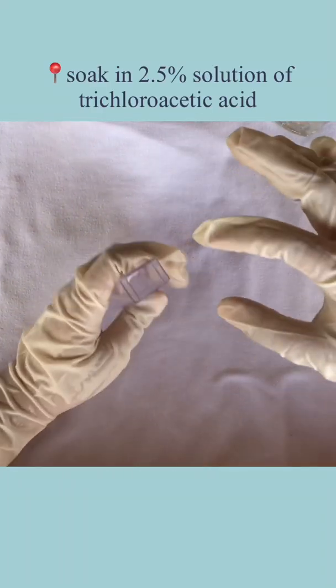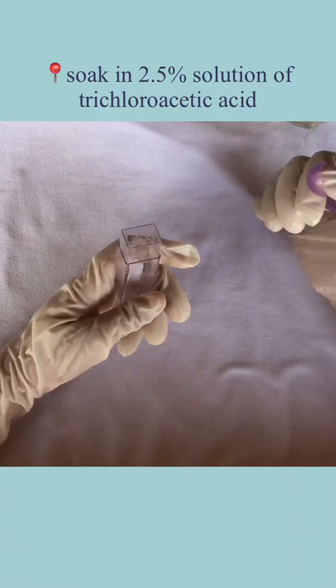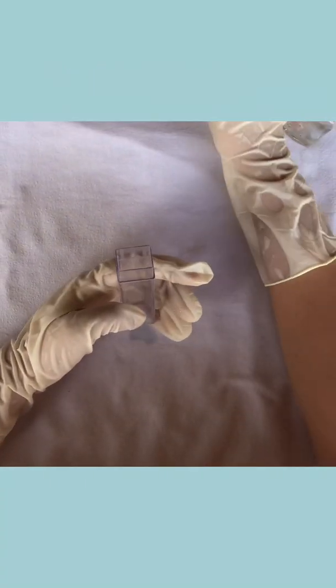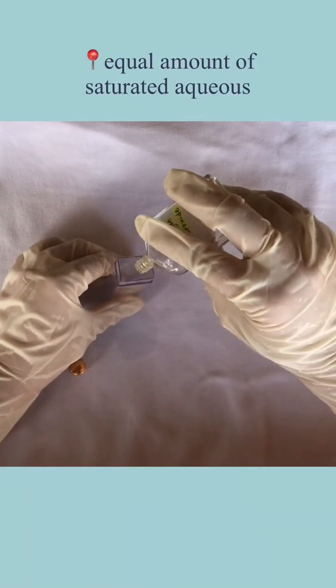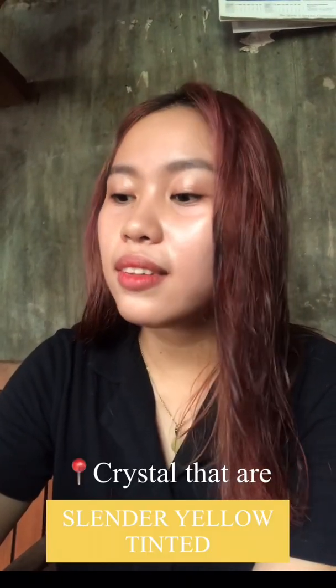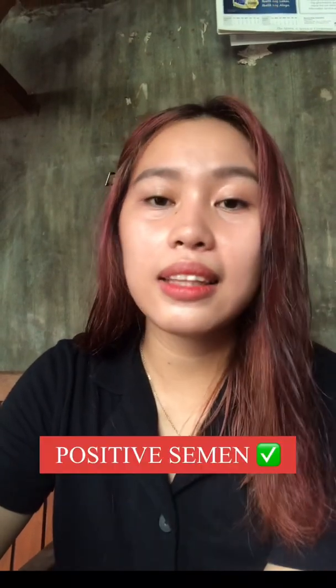The second chemical test is the Barberio's test. Soak a piece of stained material in a 2.5% solution of trichloroacetic acid for one hour in a test tube, centrifuge the test tube, and then add an equal amount of saturated aqueous solution. After observing under a microscope, the result shows crystals that are slender and yellow-tinted, which means it is positive.